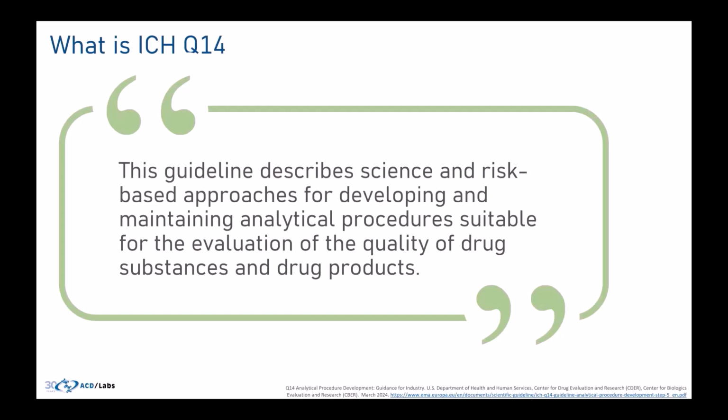So what is ICH Q14? This guideline describes science and risk-based approaches for developing and maintaining analytical procedures suitable for the evaluation of the quality of drug substances and drug products. They also mention that it can be applied to other analytical procedures.